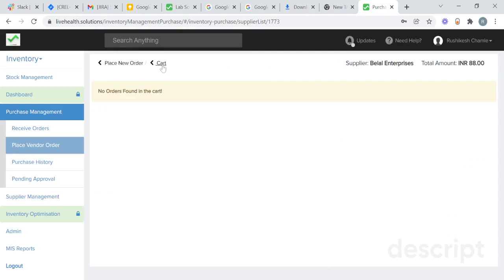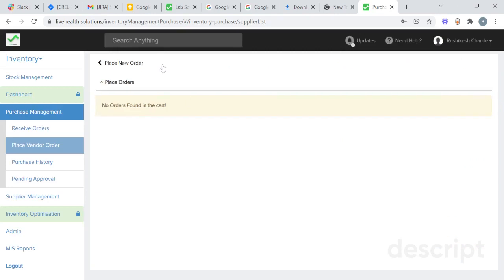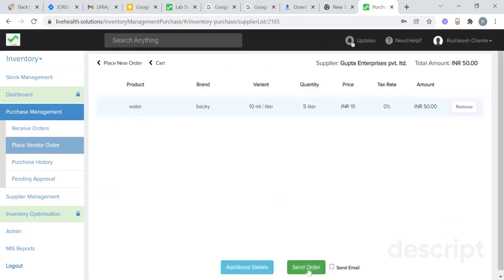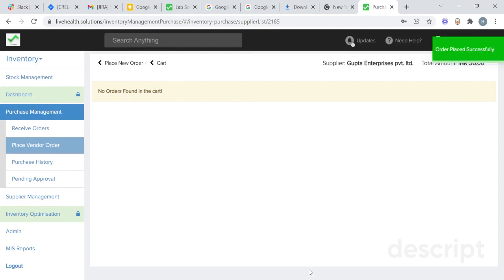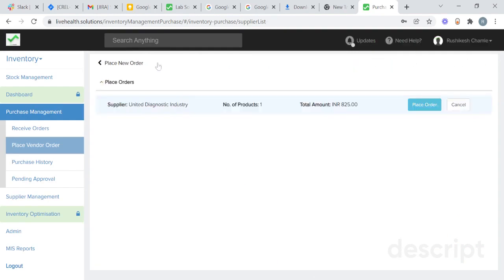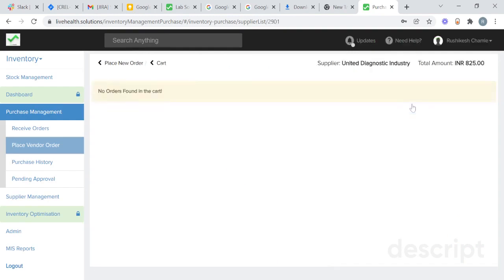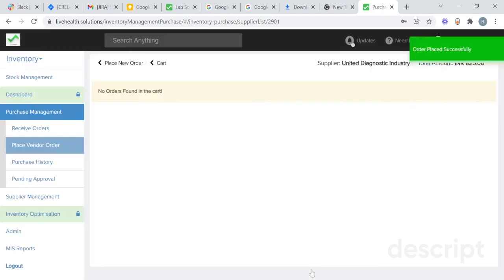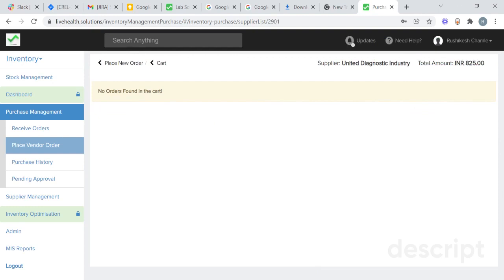Go to cart and click on place, then click on send order. Go to cart again, click on place order, and click on send order. We have now placed orders for all three products.